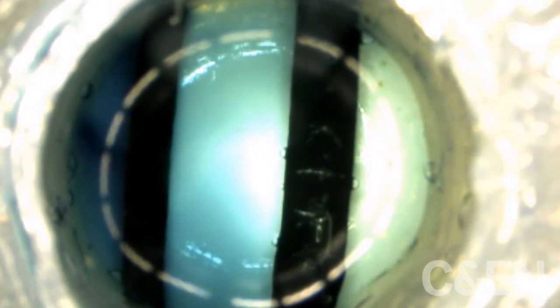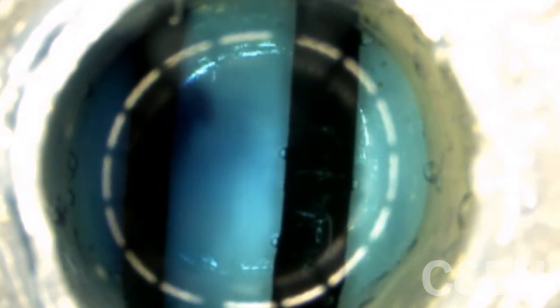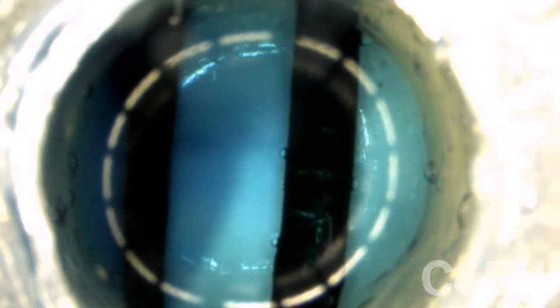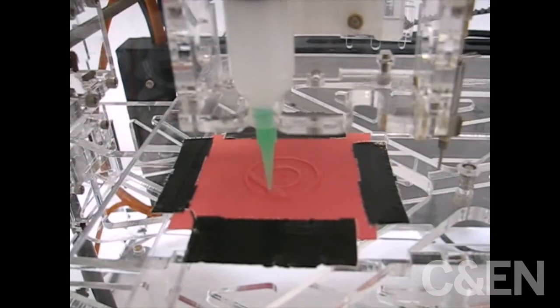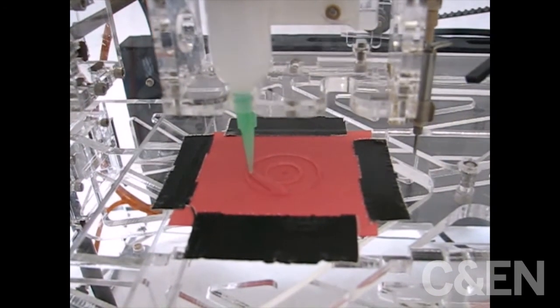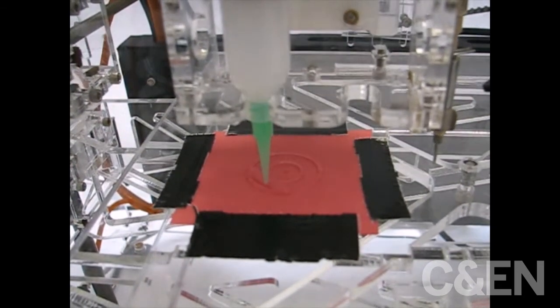Cronin and his group believe that this relatively cheap, automated, and customizable 3D printing method will make it possible for synthetic laboratories and small companies to access chemical engineering tools typically employed only in large-scale industrial settings.